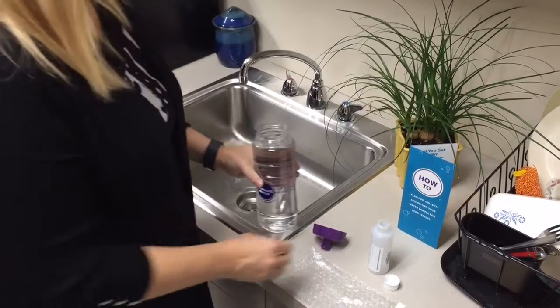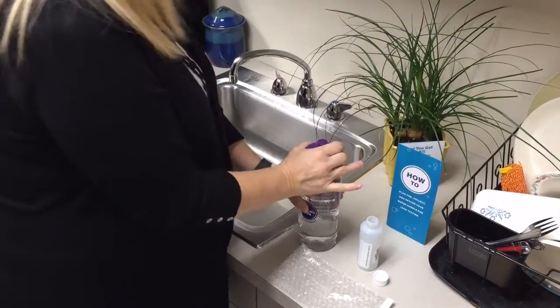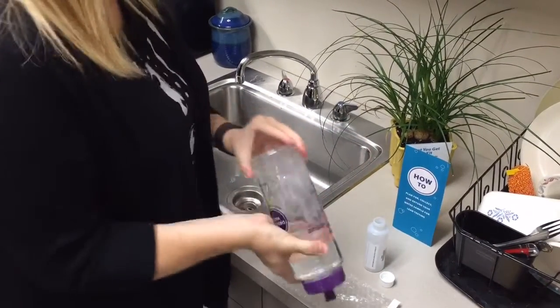Turn off the water. Put the lid back on the large sports bottle and screw it on tightly. Shake this bottle and mix the sample thoroughly.